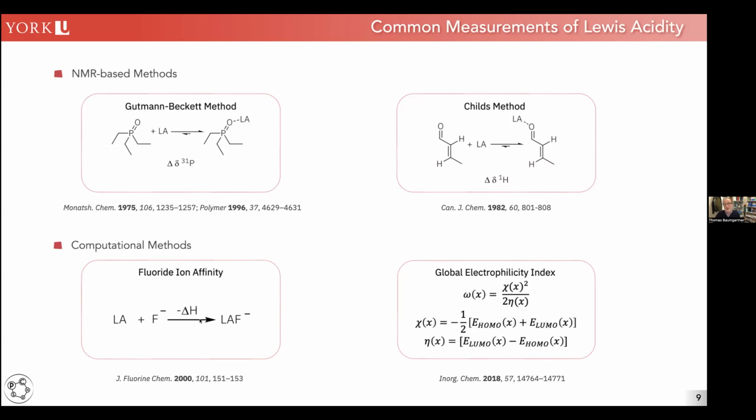This is very limiting, obviously. It will only give you information on how strong the Lewis acid fluoride bond is. But if your Lewis acid is not exposed to a fluoride, there may be questionable value in the result that you get out there. If you use it, for example, for a Friedel-Crafts alkylation or something like this, there's no fluoride in there. So the fluoride ion affinity may not actually be something that's useful in that context.